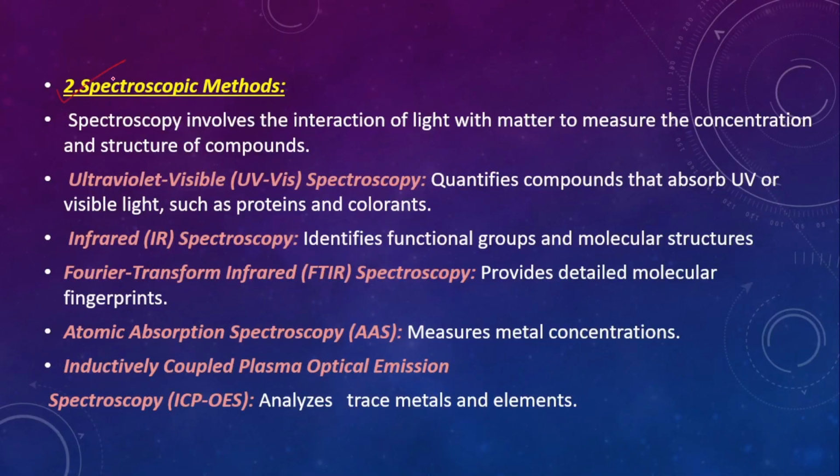Today I am going to explain about the spectroscopic methods. Actually, this is a vast subject, and much detailed information is not required for food analysis. So, I will explain it in brief.